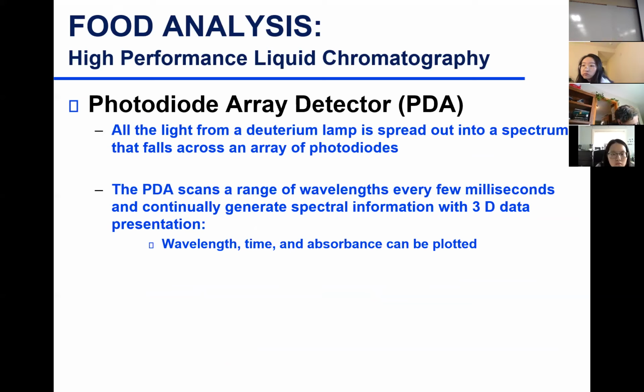Yes. So Holland is asking if I can only change it once, what do I do? What do I do if I have multiple, not just two components at different wavelengths? That brings me to the photodiode array detector, because that UV detector has a limitation. This one is going to solve that limitation for me. This one, I can detect multiple components and select for every component its own lambda max. So that takes care of this problem here, the photodiode array detector.